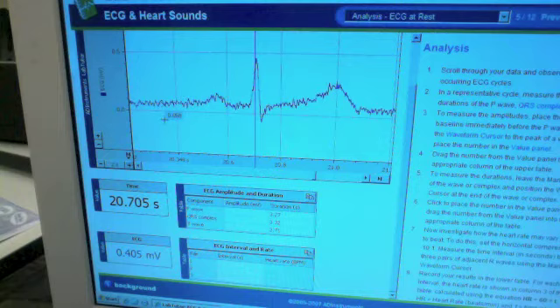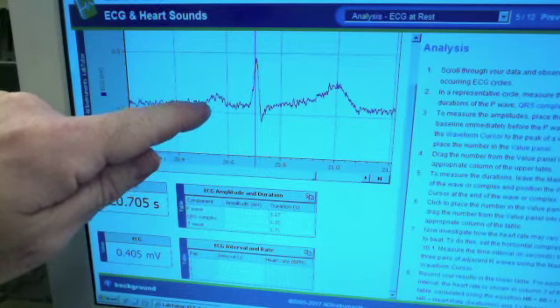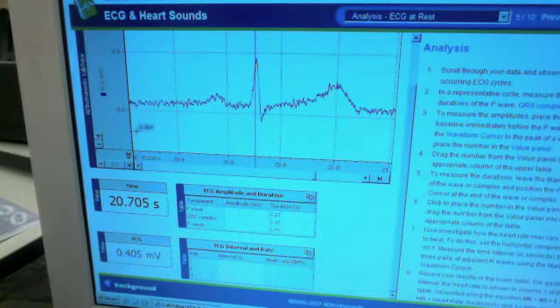So what I'm going to do, they talk about measuring the amplitude. Now you'll notice there's a lot of noise here, and hopefully that will be a little better in your recording. But you'll also notice that we're not actually at 0. Here would be 0, we're above that. So we want to measure things relative to some baseline. So I'm going to say that this is approximately the baseline. And I'm going to want to measure everything from that.